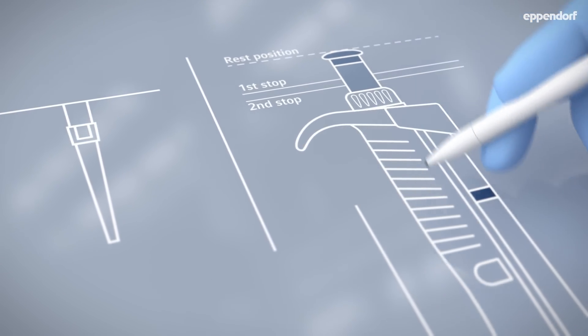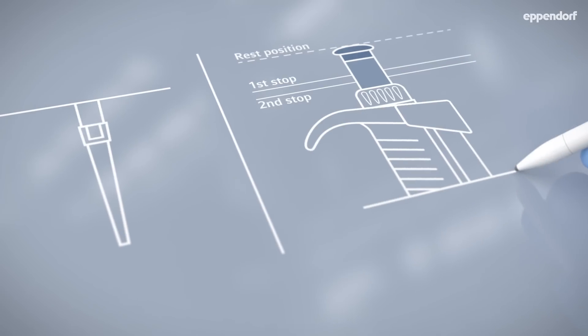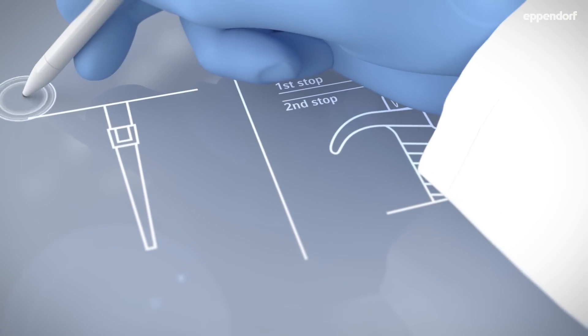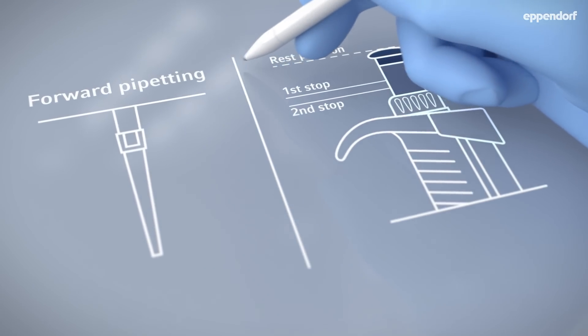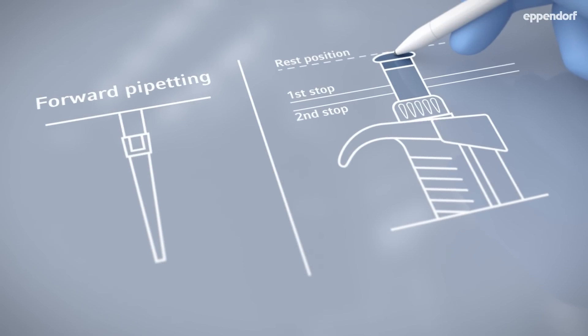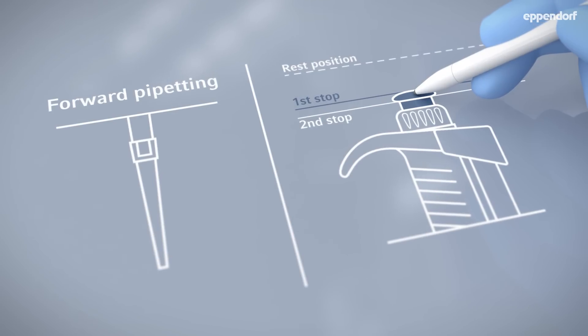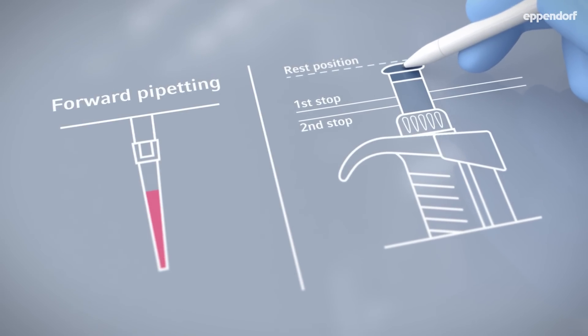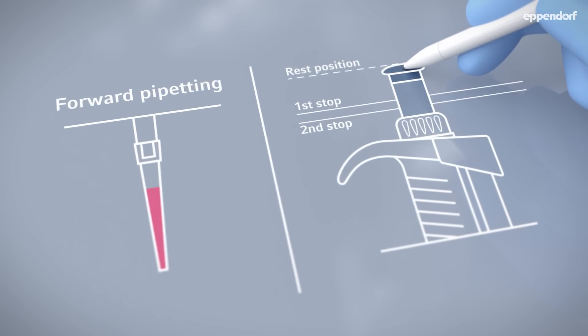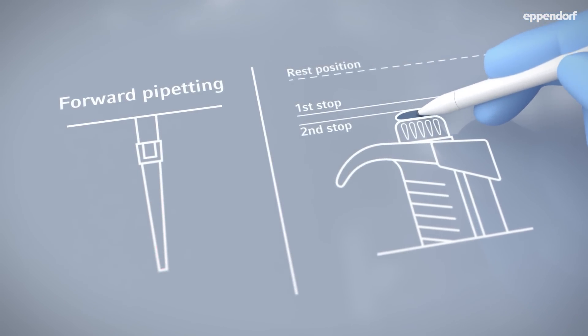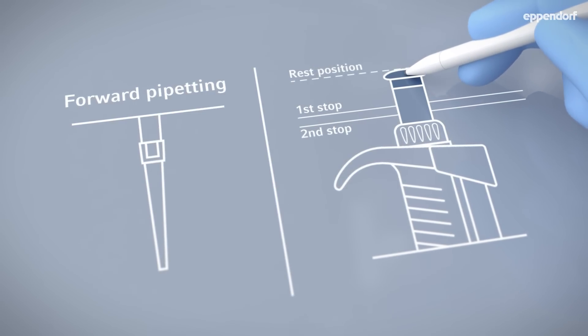Whoops! Now watch the pipette tip on the left as I move the button on the right. With forward pipetting, press the operating button to the first stop. Immerse the tip and move the operating button up to the rest position. Dispense the liquid by pushing the operating button down to the second stop.